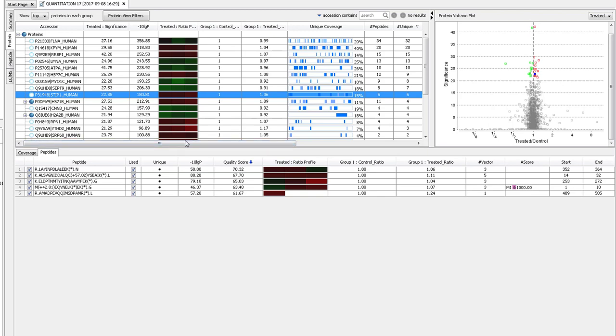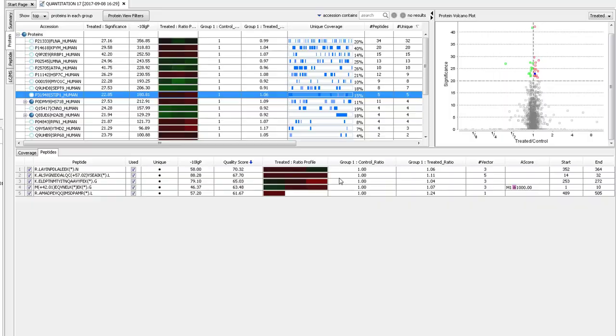The significance column gives the significance of the quantification result. The minus 10 log P column gives the significance of the identification result. Select a protein to see its peptide details. Its position in the volcano plot will also be highlighted in blue. Double click on a peptide to see the peptide details.